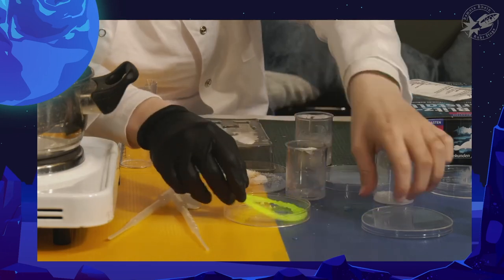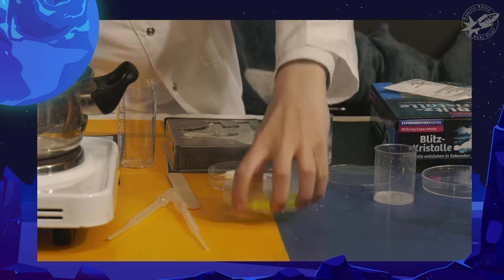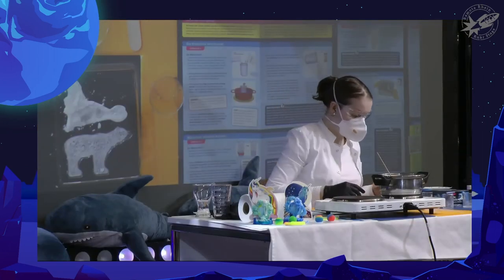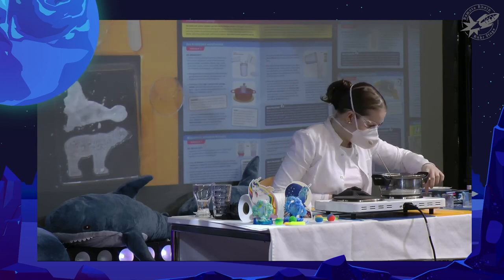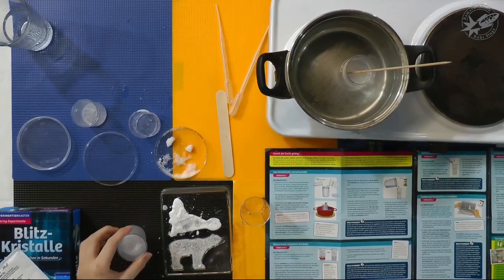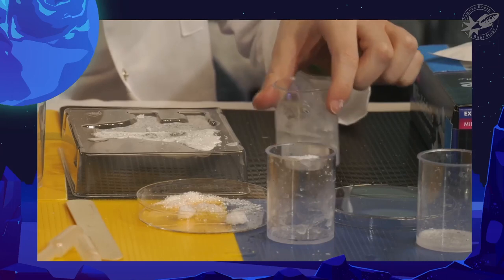The other ring was a lot wider. This just took about one night to get ready. Ich probiere es einfach mal mit ein bisschen mehr Starterkristallen. Viel hilft viel, sagte man. I'll try adding some more starting crystals.